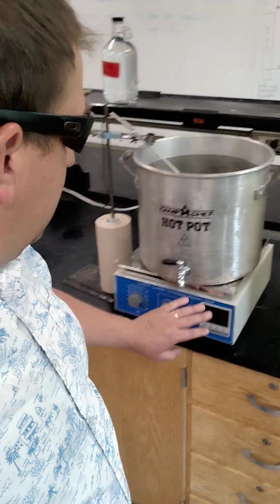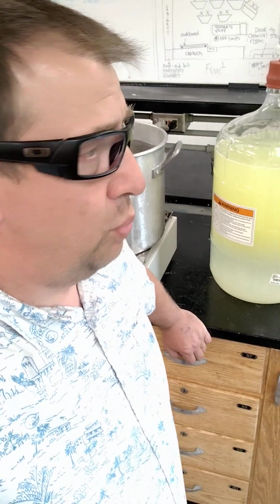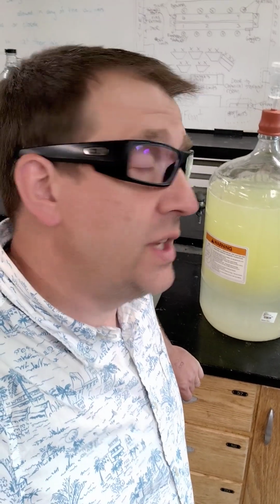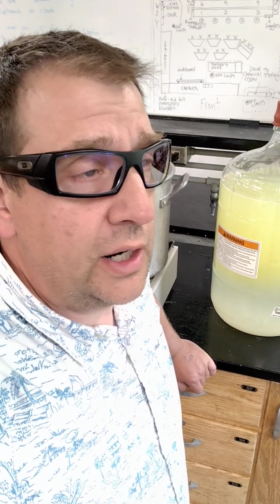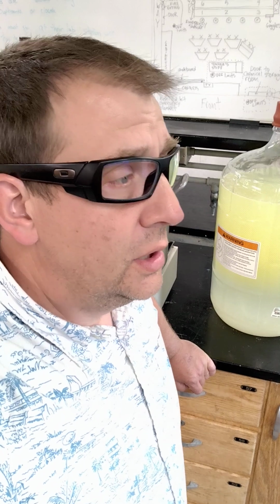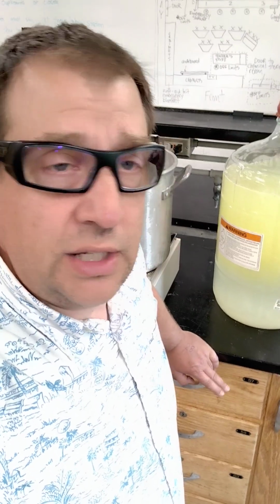We've got all sorts of other chemistry equipment that we're going to be using. Right now, this is, again, our very first batch. We're recording all of our information to be compliant with the federal government on this. We do have to record all sorts of data and ensure that everything is secured. This is a locked laboratory, and we do have locked fire cabinets to store all of our finished product. And that's finished product after it's been denatured, which I think I mentioned earlier.